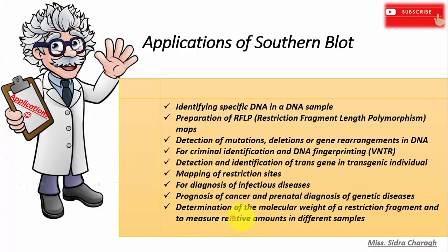It also helps to determine the molecular weight of a restriction fragment and to measure relative amounts in different samples. So that's all about Southern blotting.